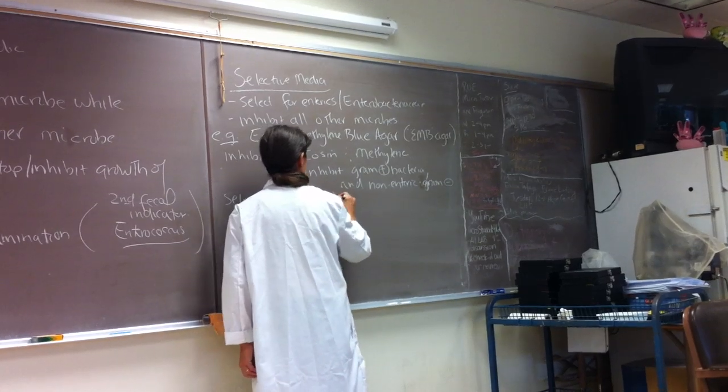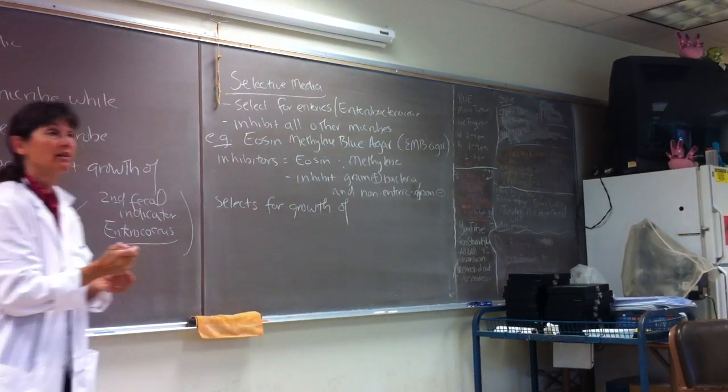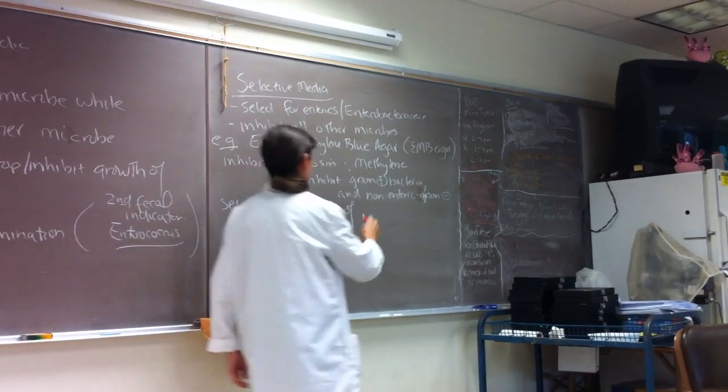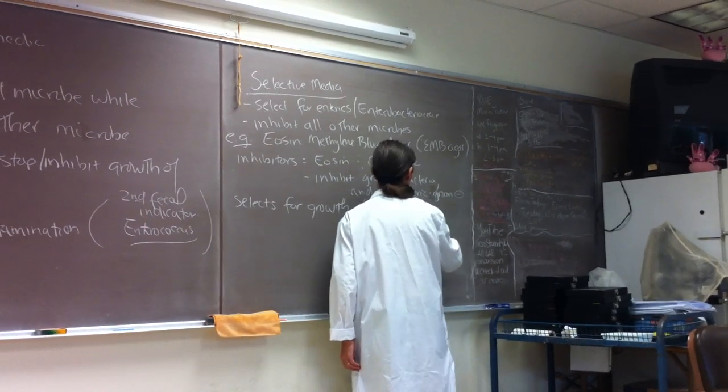So who will be selected for? Who do we want to grow? The enterics, those Enterobacteriaceae, great. And I know you guys, this is just like, oh my goodness, this is so painful.